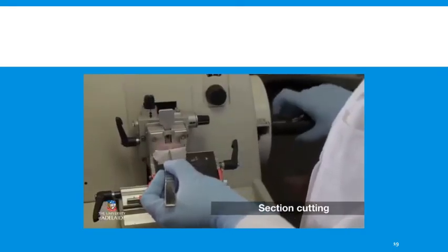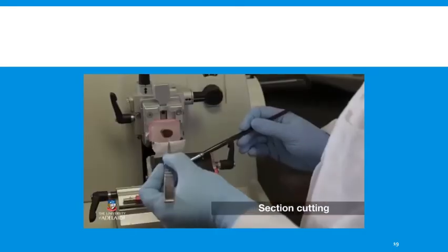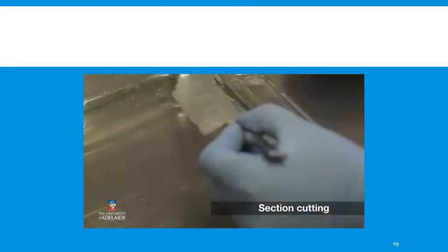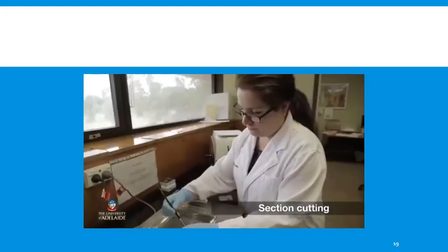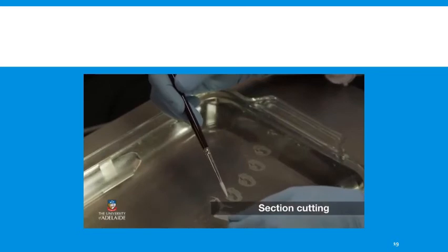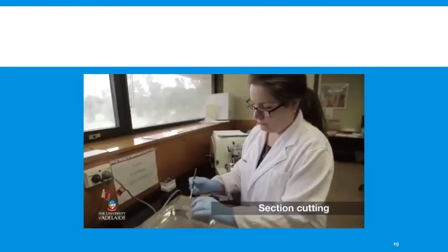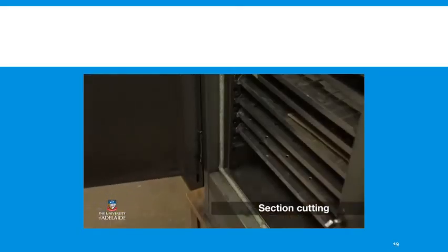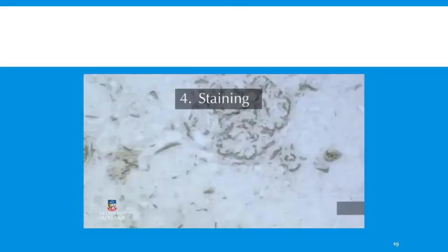By rotating the handle, the block is advanced by 5 microns and lowered down past the knife to produce a section. These sections of wax and tissue form a ribbon that can be lifted off the knife and laid down in strips. Due to compression, the tissue sections are slightly wrinkled, but most folds can be removed by floating out the ribbon or individual sections on a warm water bath. Sections are collected up onto a microscope slide and dried in a 40-degree oven overnight.